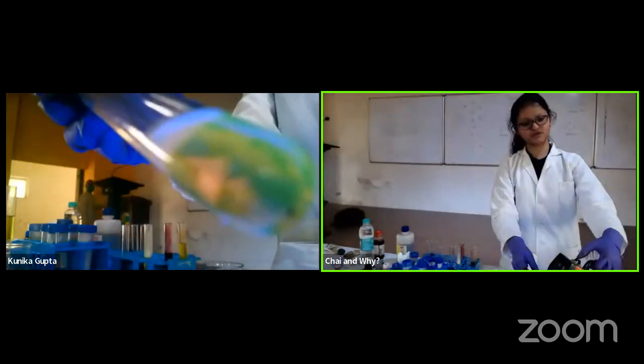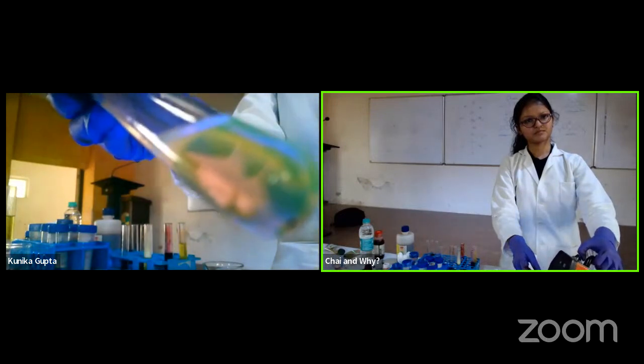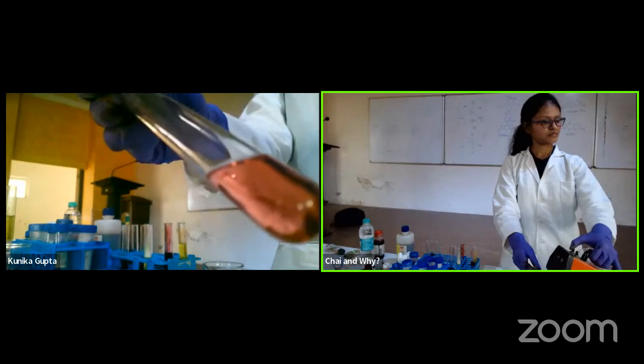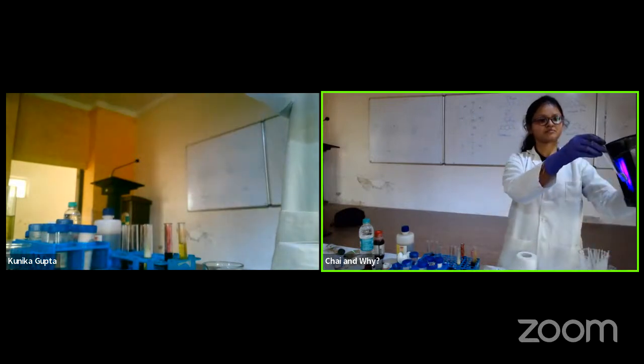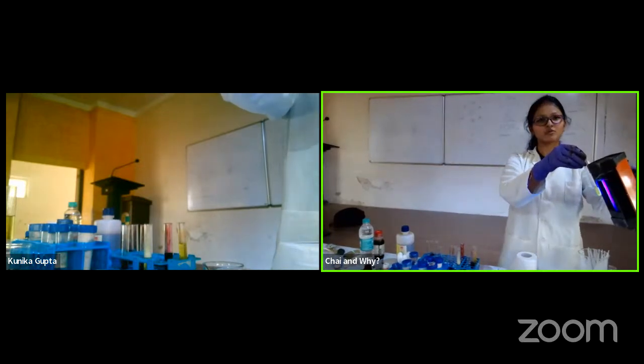Do you see a fluorescence? Turn it on and off. Off. Yeah. And on. It's good. Or maybe this is good for online, but for the people in the room, just lift it up and do it. Fine. So this is a dye formation.